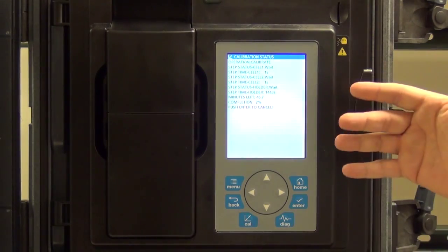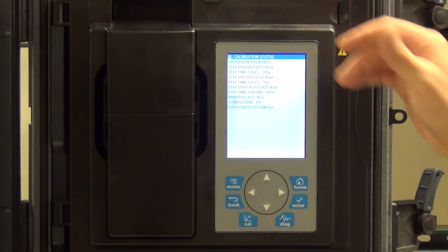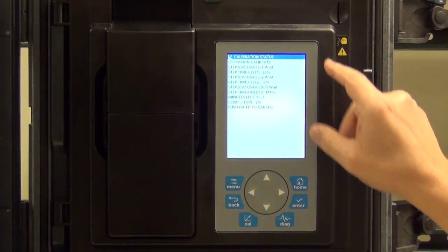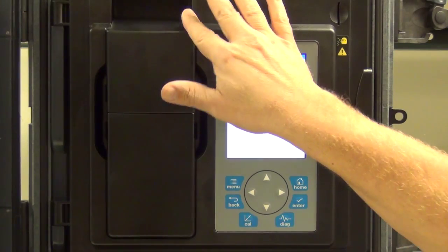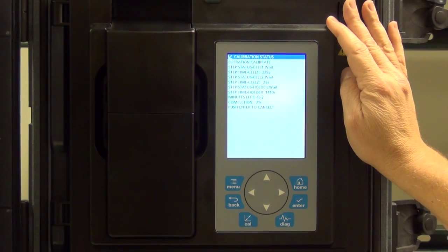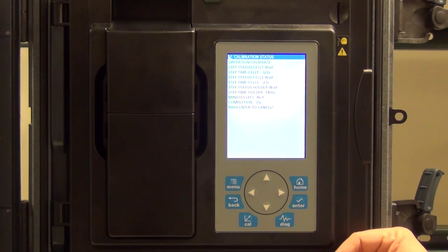So it will separately measure the 0 standard below, measure it in both of the 2 colorimetric cells, followed by measuring the onboard 2 milligram per liter ammonia standard. Since the standard is ammonia, the third reagent, or actually R1, reagent 1, which is the hypochlorite solution, is added during the calibration sequence to both cells to convert the onboard ammonia standard into monochloramine. After the calibration completes, the analyzer will go back online if it passes the calibration and start analyzing the regular sample.